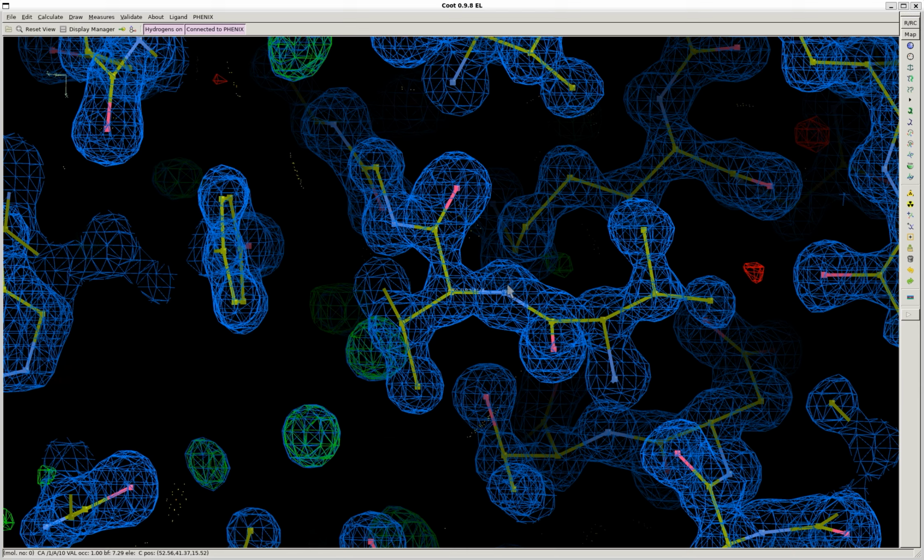And just like that, we can make the refinement process in Phenix and then go and make individual small adjustments to make it fit even better, and then fully refine the process and do this cycling of Phenix refinement and Coot refinement several times until the R-free and R-work are as low as possible, up to around 0.2 or lower or even 0.15 or lower. When it gets to that point, the model very strongly represents the electron density map, bringing you closer and closer to the real answer and the real structure of the protein, which can be used for therapeutic drug design.